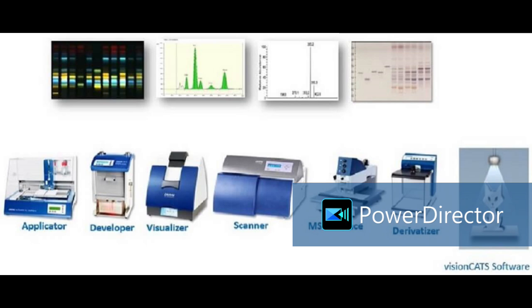Select multiple wavelengths 200, 220, 240 with intervals of 20 nanometers. Scan at all wavelengths; at some wavelength your unknown analyte will absorb light. If it is absorbing the light, you will find it out, you will detect it. If still after multi-wavelength scanning it is not visible, then you can go for derivatization. If it does not absorb any light at all, then derivatize it.